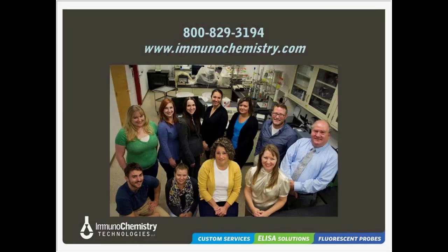Where things really come to matter is when you are trying to develop something that's reproducible, something that's going to be sold commercially, or that's going to be used for long-term accurate assessment of analyte in a particular sample. When you have that situation, you better stick to the more name brands that you can trust, type of plate that are consistent, where basically when you incubate and absorb your antibody to the plate, they get the same amount of antibody bound on the left side as the right side. They're consistent all the way across.